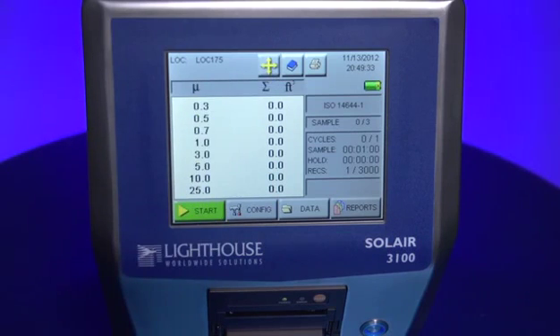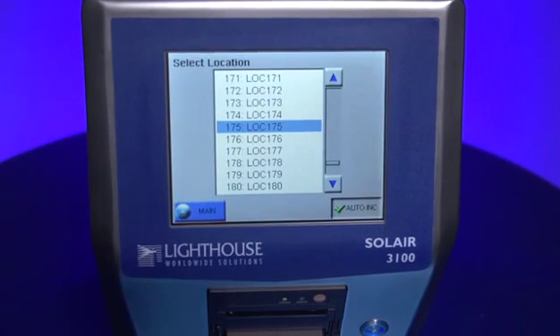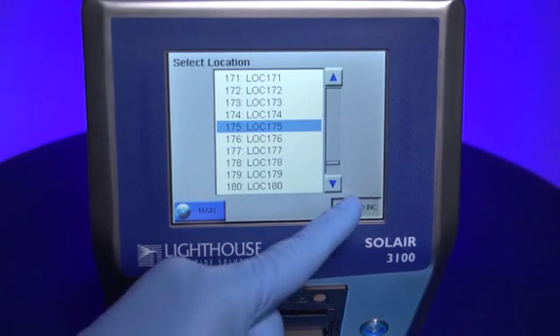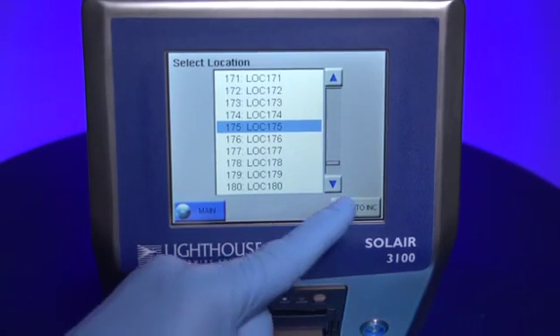The location may also be automatically moved to the next sample location after each sampling cycle is run. This feature can be turned on by touching the Order Increment button in the lower right of the display.